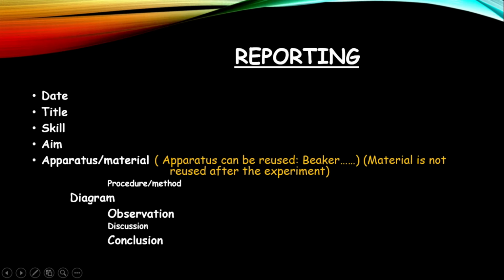Now, you might wonder why this is formatted like this, or why the color is here. This colored writing is just to remind you as to what we would refer to as apparatus versus material. However, the indentation here is a reminder that when we write our procedure, we want to step away about 1.5 inches or 2 inches away from the left margin and have an indentation there for the teacher's report, or your supervisor's report if you were in the real work world.